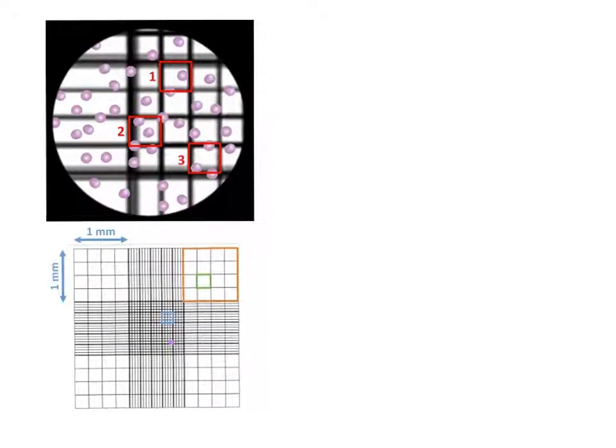So in this question, what we want you to do is to use the picture you've been given in the haemocytometer to work out the density of cells in your original suspension. So for this example calculation, I'm just going to calculate this based on this square alone. We're asking you for an average, but we're going to do it for this square alone.